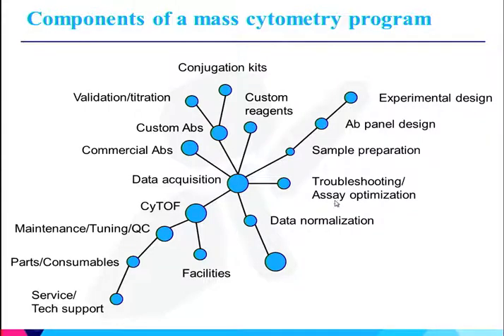So this is an important step to account for differences in the machine over time and across institutions, and it's a way of developing much more robust data. And finally, of course, there's the visualization and analysis of all of this. So these are all the components that one needs to think about when starting a new CyTOF facility.